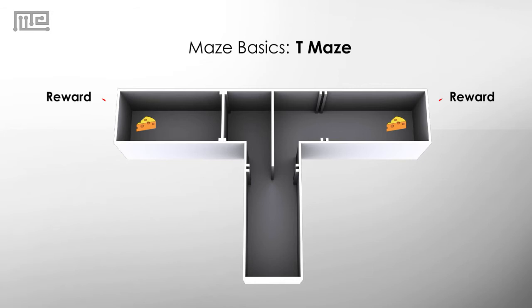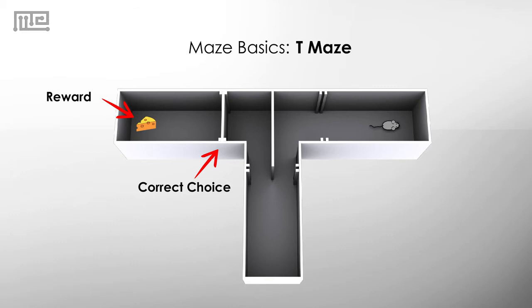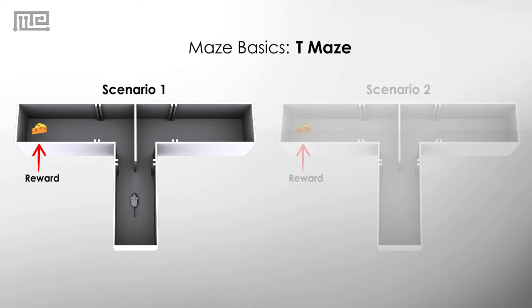Rewards are placed at the ends of both arms and one door is closed — this is the correct choice arm. The mouse runs to the open arm and consumes the reward. The door to the correct choice arm is then opened and the mouse is returned to the start.